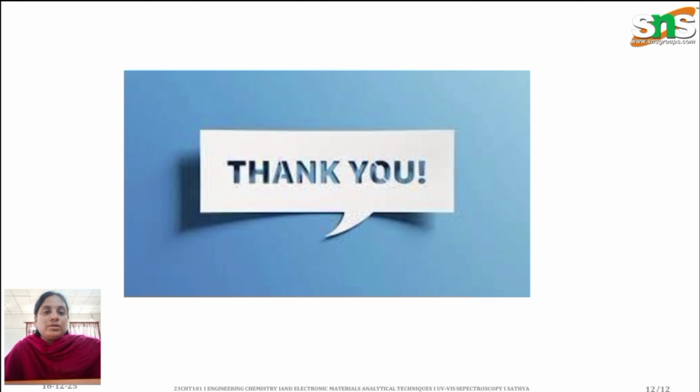So thank you. Here we discussed the introduction to UV visible spectra, the principle of UV visible spectra, and what is meant by the Beer-Lambert's law. We discussed A is equal to epsilon CL, the parts present in the instrumentation, and the applications of UV visible spectroscopy. We also discussed the importance of the monochromator, detector, and recording. Thank you.